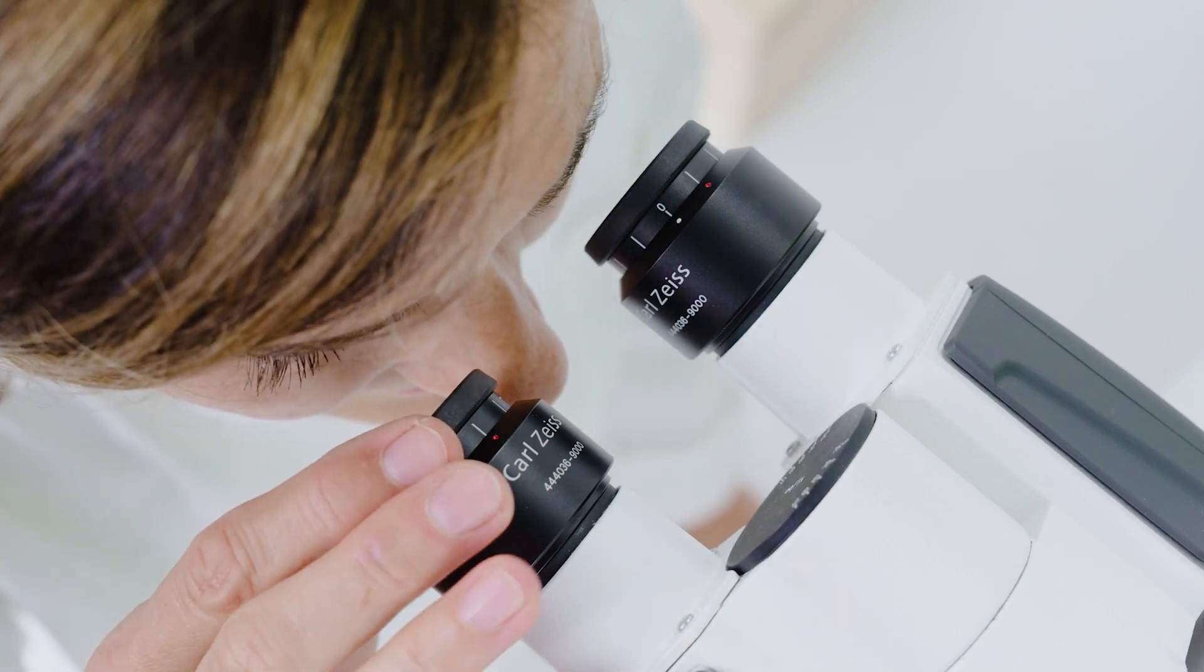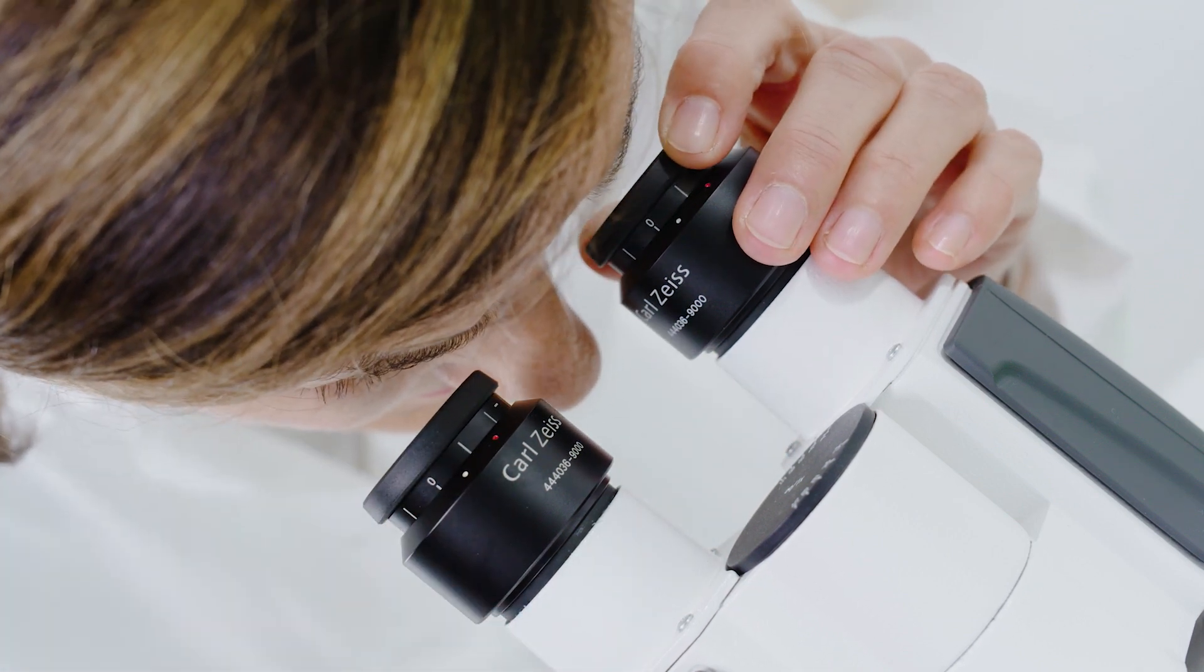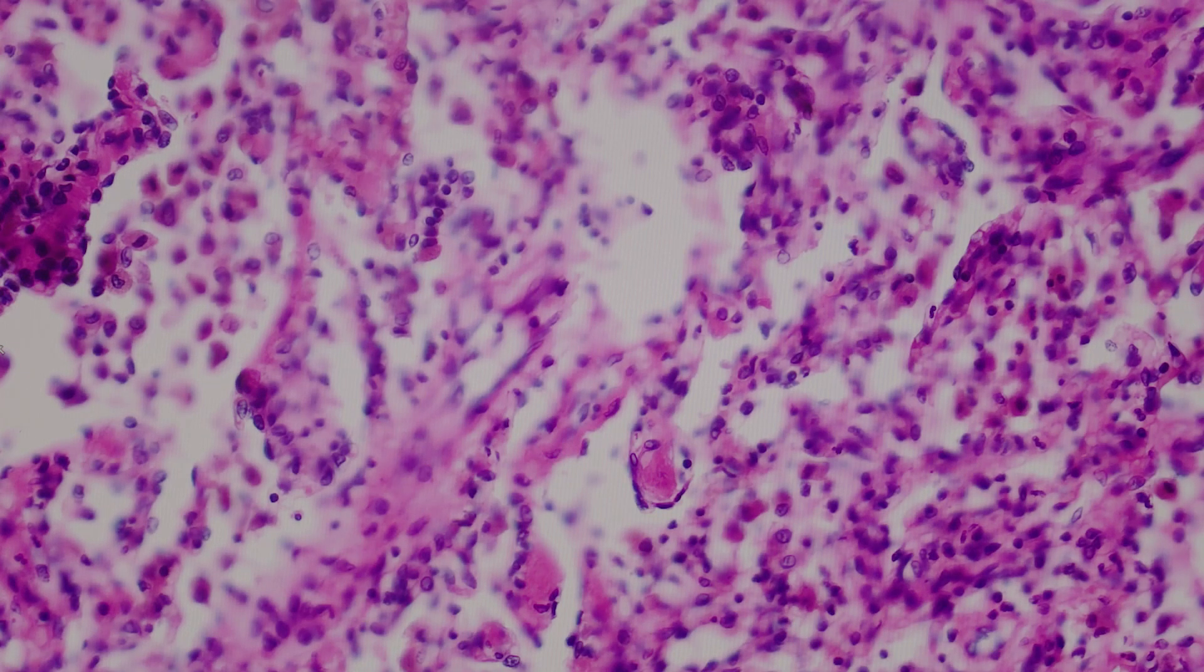Adjust the diopter correction for each eye for sharp vision. Start with a diopter setting of zero, then adjust the diopter correction for each eye individually and make sure the image appears perfectly focused.